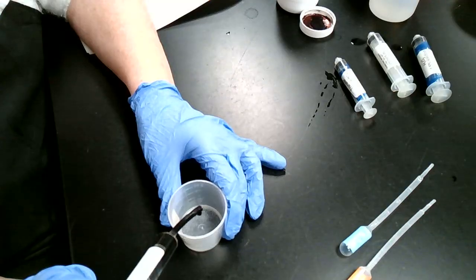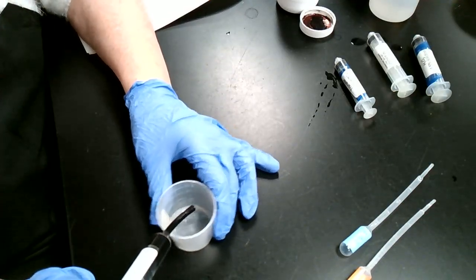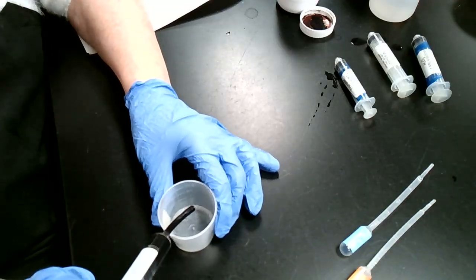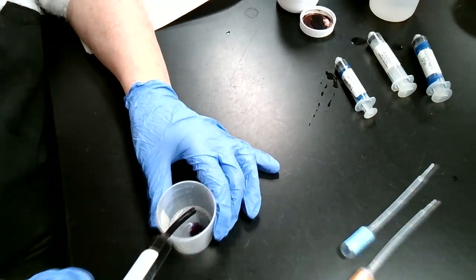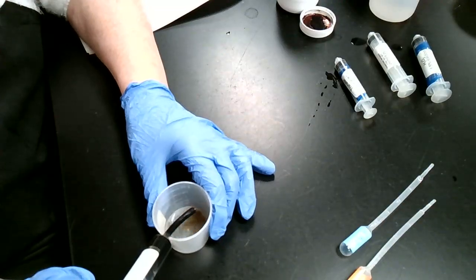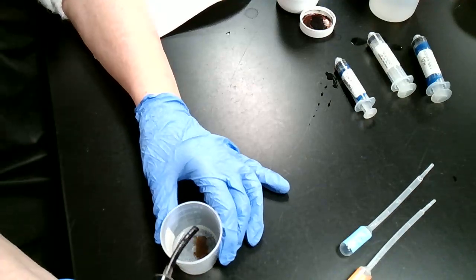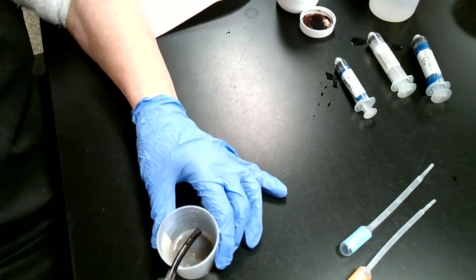So, and it's going to take me a while probably because I'm doing the baseline. This is all hydrogen peroxide and sulfuric acid in there, just a little bit of water. So, and here's where it helps also to have like a partner, because, you know, if you can't see it so well, or you can have your partner do like the swirling.